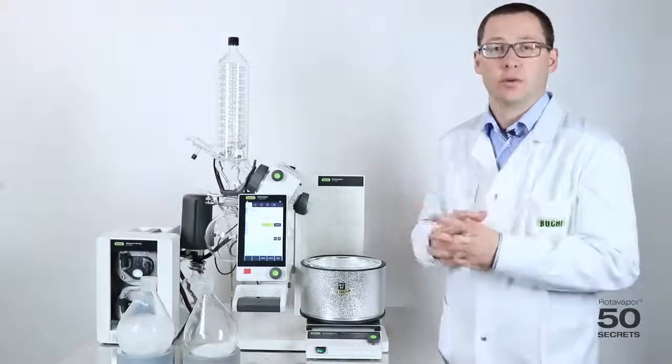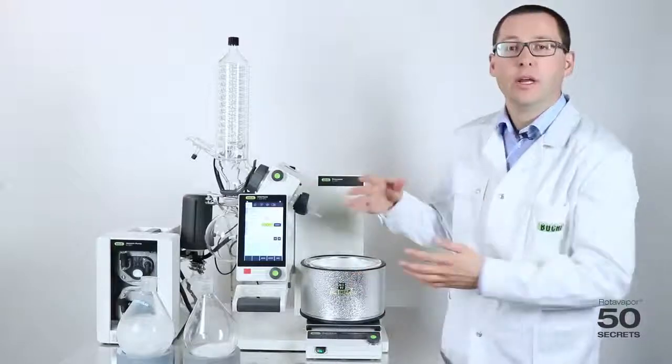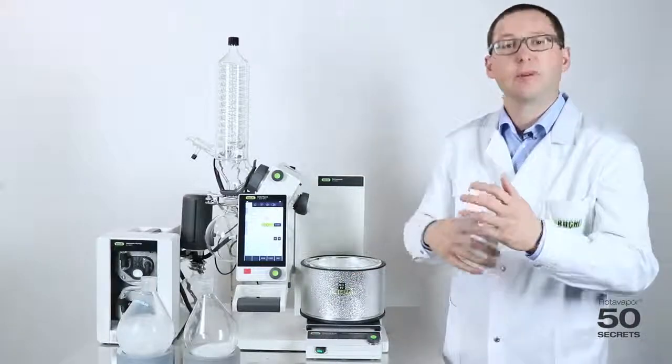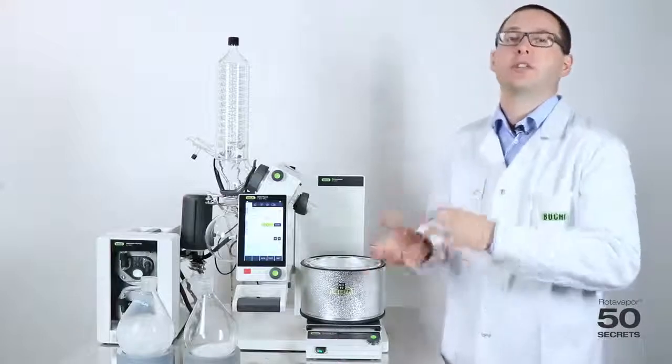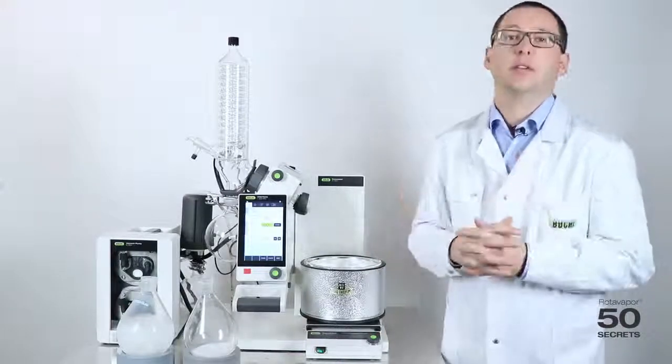The benefits of the second process, by using the rotavapor, is you do less samples because the sample preparation takes longer, but the freeze drying itself is significantly faster.